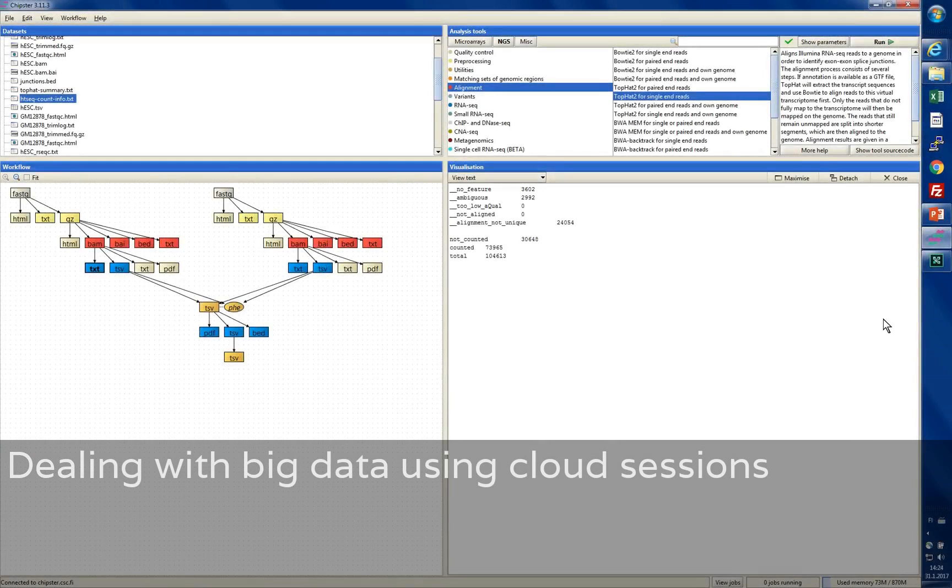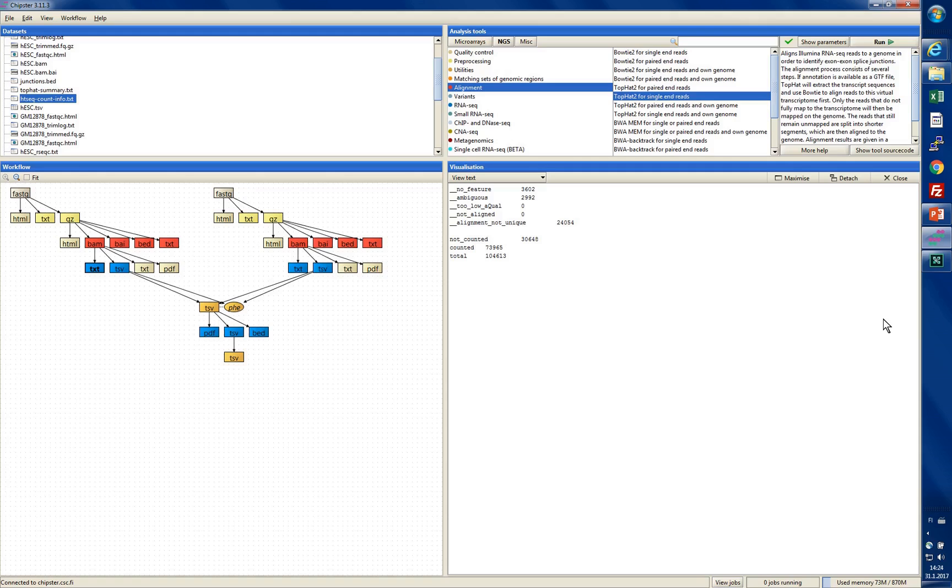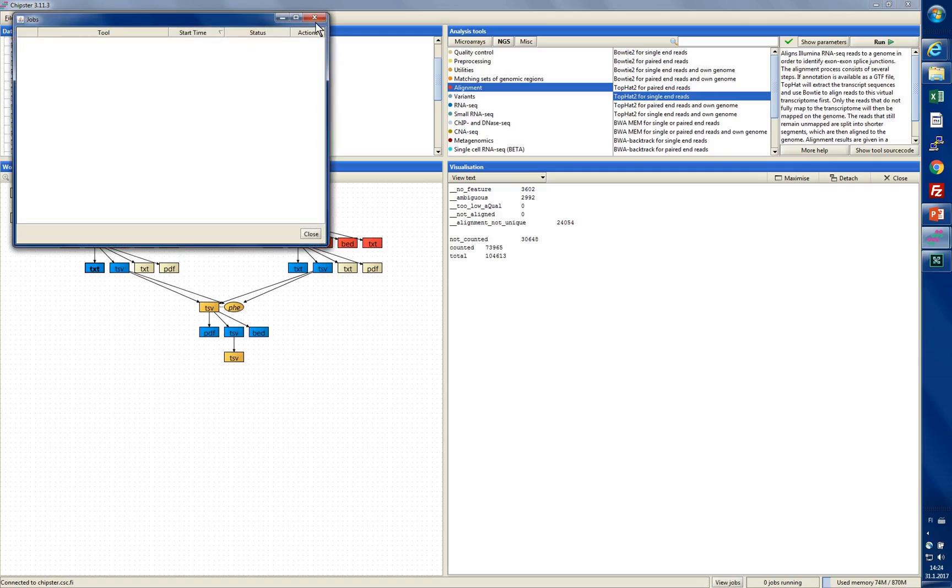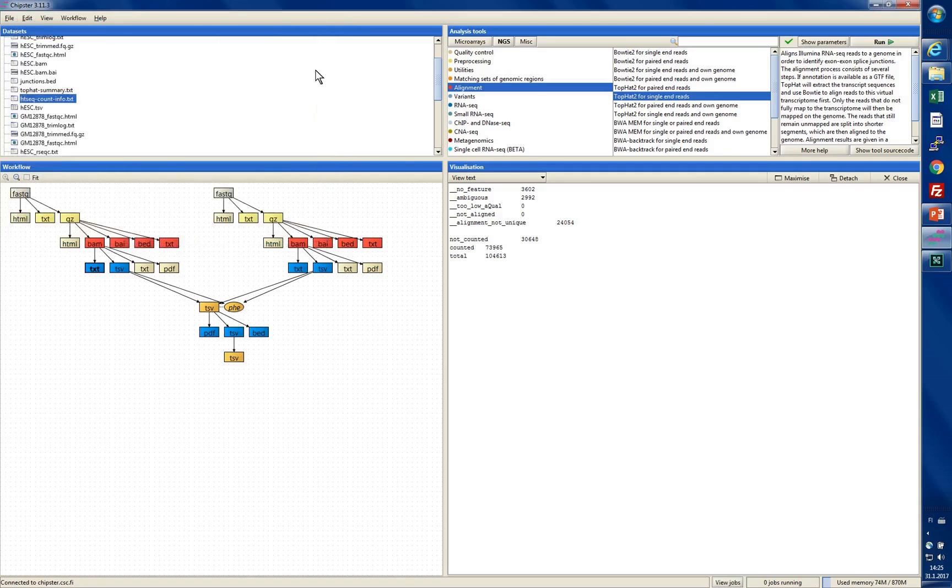When you are doing these things with real data, especially the alignment step with TopHat will take several hours. You don't want to be sitting around and waiting for it, or you also don't want to keep Chipster open for all that time most likely. What you can do when you have really long jobs is you start the job as normal. Then you check in the bottom panel, you go to this view jobs. I don't have any jobs there now because I'm using a ready-made session here, but you would have a look at the status of the job that you have launched. First it will say transferring inputs, but when that is over, that means that the data is already on the server and it's ready to run.